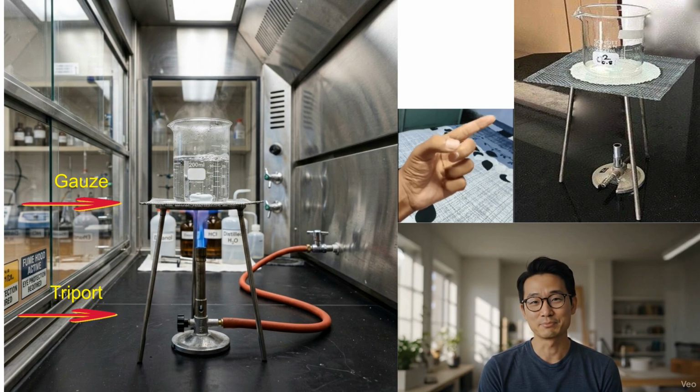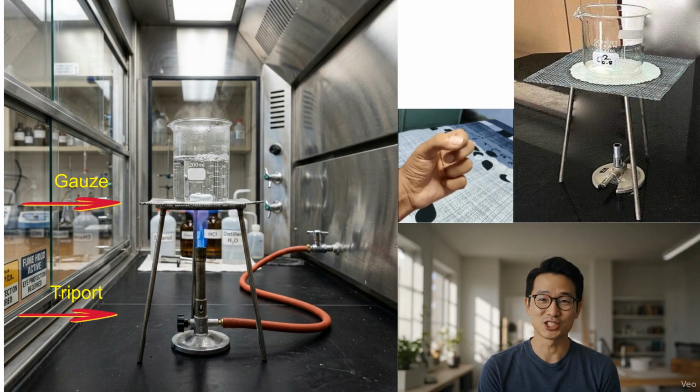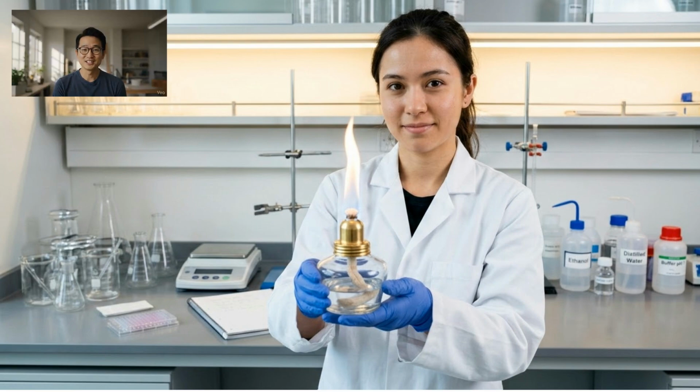Gauze is used to hold items above the Bunsen burner that are too small for the tripod. That is why it distributes heat evenly across the surface, with the white patch or circle in the middle. This is a spirit burner, or alcohol burner, which contains a liquid fuel, used for heating, sterilizing, and burning.